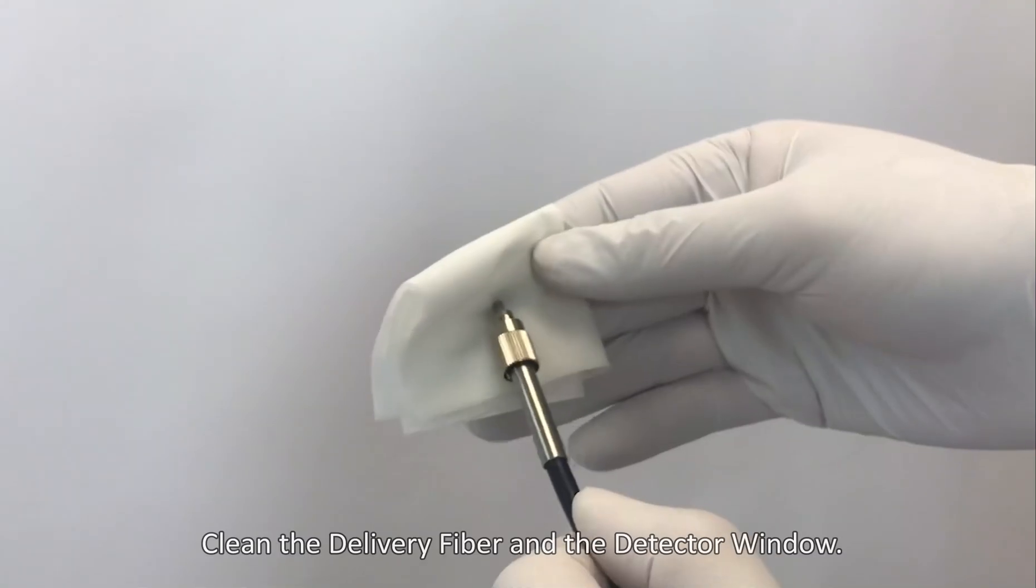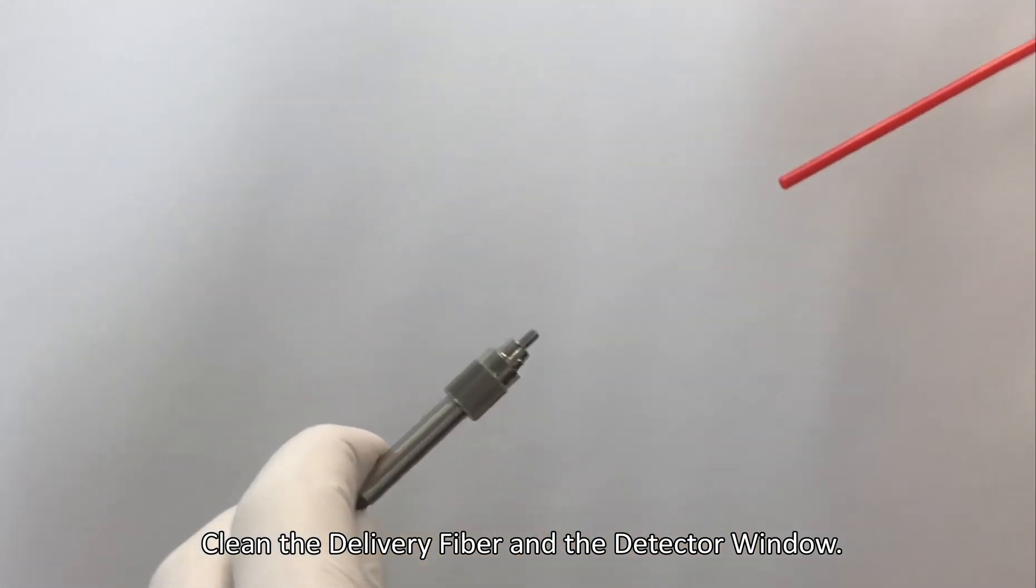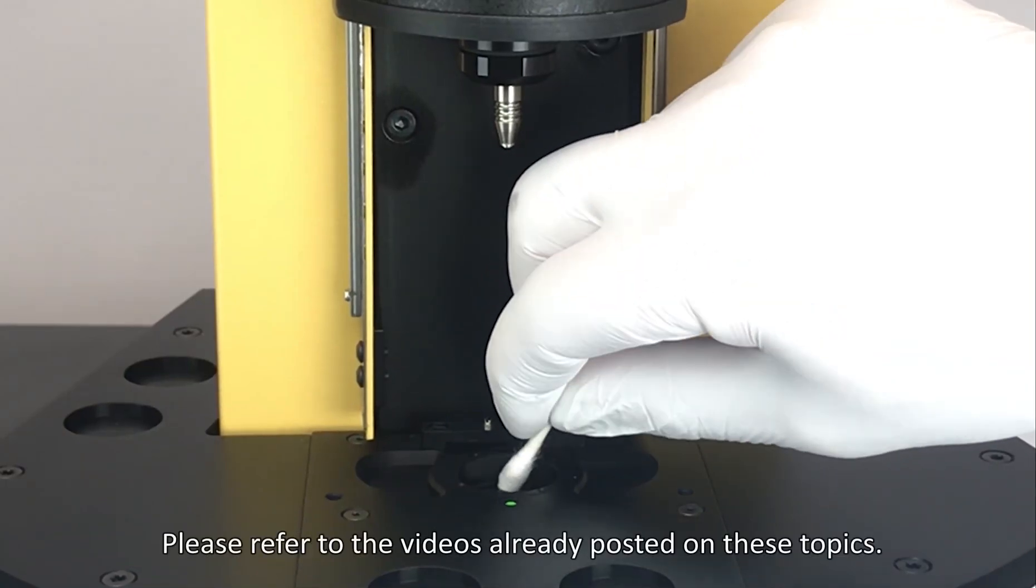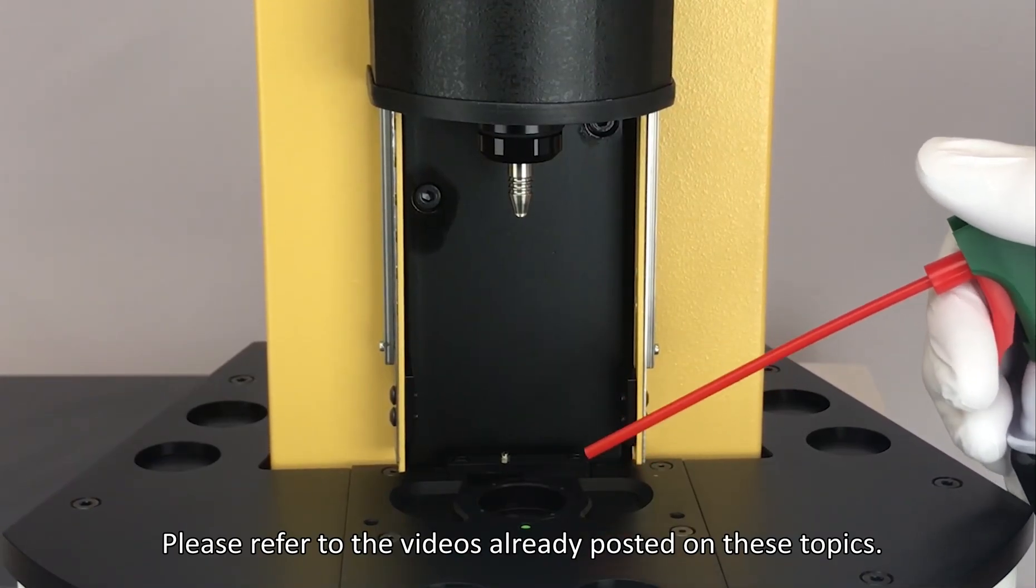Clean the delivery fiber and the detector window. Please refer to the videos already posted on these topics.